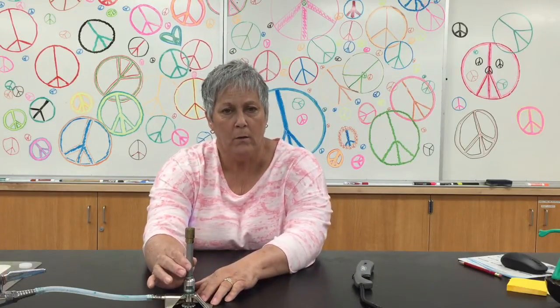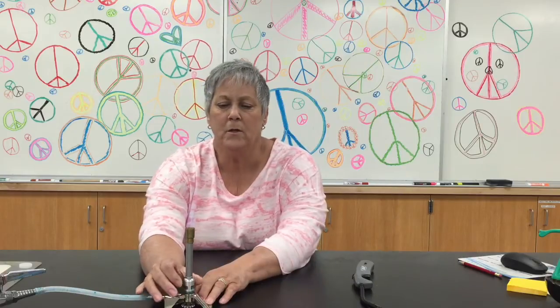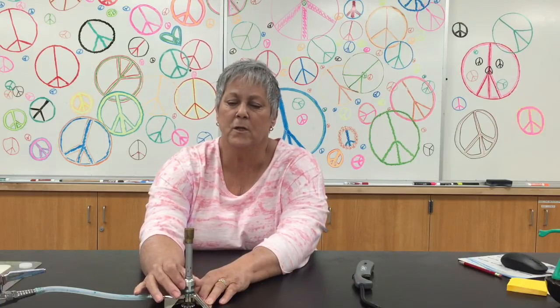This is called the barrel of the Bunsen burner, and you can adjust the mixture of gas and air by rotating the barrel. I'm rotating it counterclockwise right now and I'm getting a stronger blue cone, but if I turn it clockwise the flame becomes more diffuse. So just gently rotate that barrel until you get the flame where you want it.